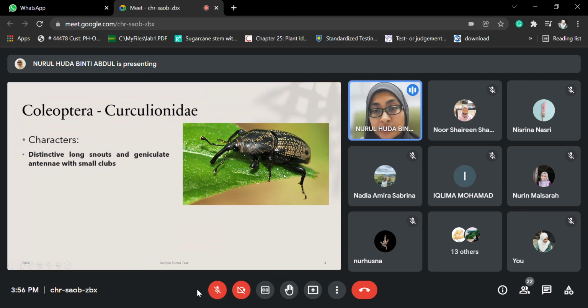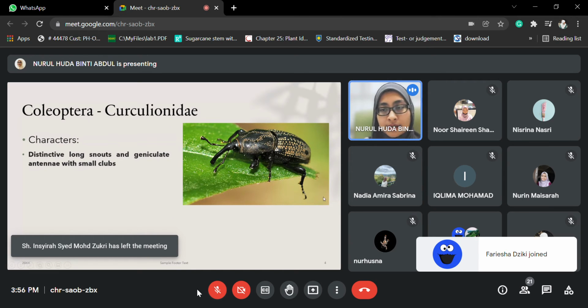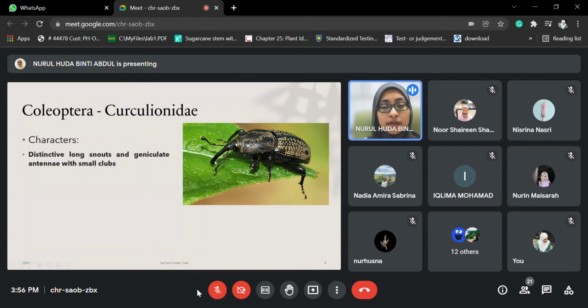Cumanya kita sebut, since kita describe based on picture. Otherwise kalau katalah you have your sample, mungkin kamu boleh pusing, angkat dia punya elytra ke, tengok underside of the abdomen ke. But for now, since we cannot do that, so we identify based on apa yang kita nampak sekarang lah.